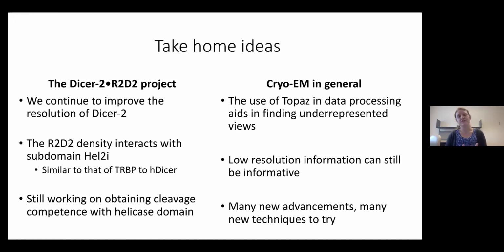Also, low resolution information can still be informative. The structure that I showed you today was at 6 angstroms. We are still able to get some biological relevance from that structure. But of course, we want the high resolution structure to get even more information. And with the many new advancements and techniques coming out in CryoEM, we're really excited and enthusiastic to be able to try all those ideas to get a high resolution structure, hopefully in the near future.